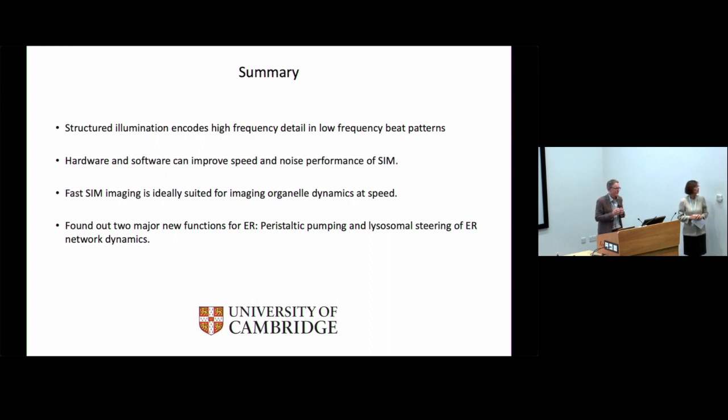So you said the resolution goes down to about 100 nanometers. Would that allow you to sort of track viruses going through a cell, for example? Yes. Have you ever tried that? You can't resolve them in the sense that Rado just said, but you can certainly track them easily. That's not a problem. We've done that. In fact, we've used other methods in combination with expansion microscopy, looking at virus assembly inside cells.